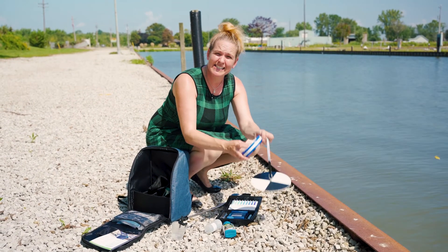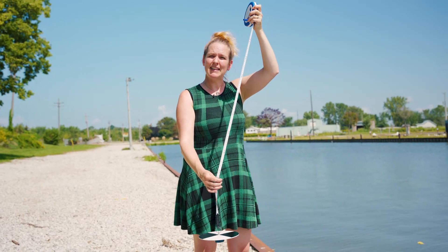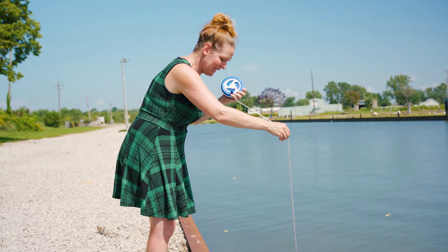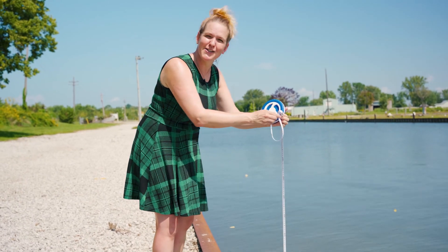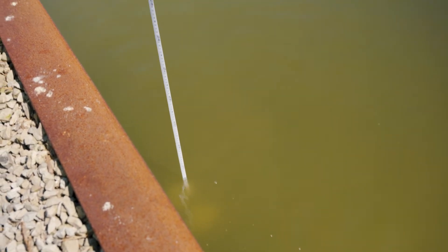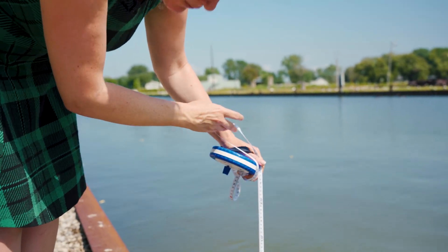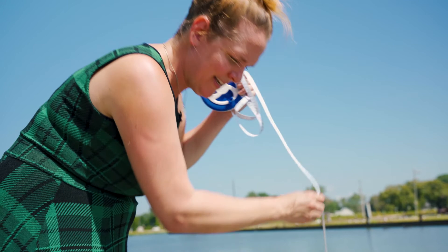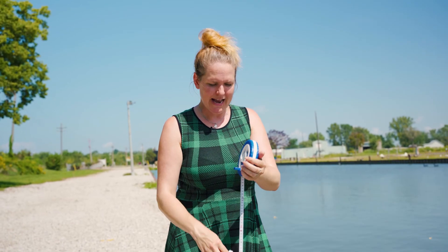Our last test is our Secchi disc, a tool that's been used for about 200 years to measure water clarity. We measure it by dropping the disc in the water and measuring the length of the rope in meters. Make sure you don't wear your sunglasses for color comparisons. This is not very clear water — I can already not see it, and it's only about 30 centimeters down, so we'd record that as 0.3 meters. If you can see the bottom, you can also use this to measure water depth, though the rope is only about 20 meters, so it's not suitable for deep spots.